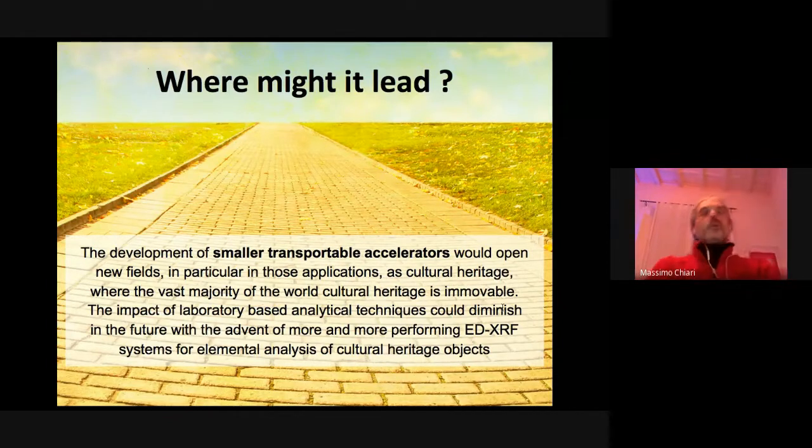So where will we go with this? Let's say with the background of expertise that we have at LABEC. Obviously, when we are dealing with the application of accelerators to cultural heritage, the main obstacle is the fact that most works of art are unmovable.